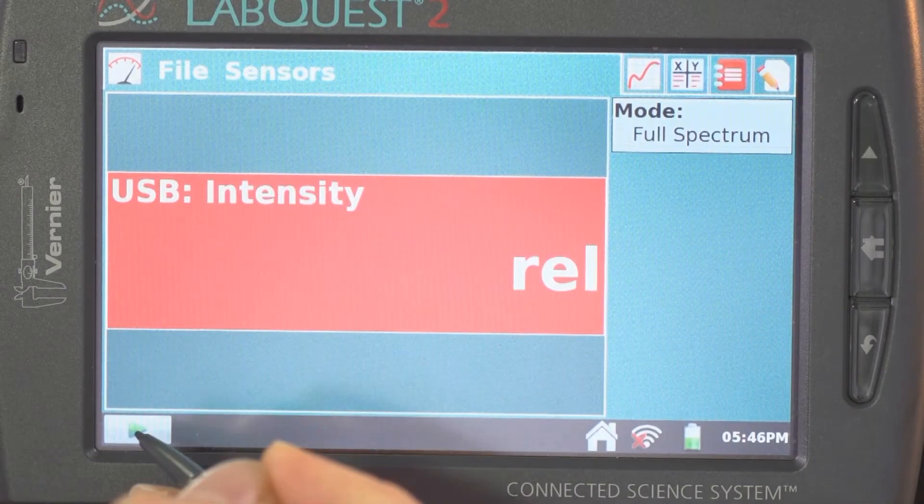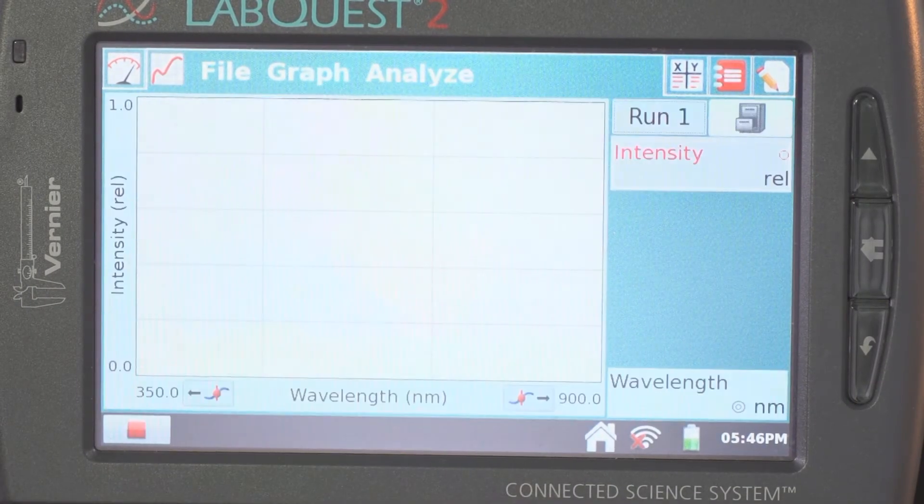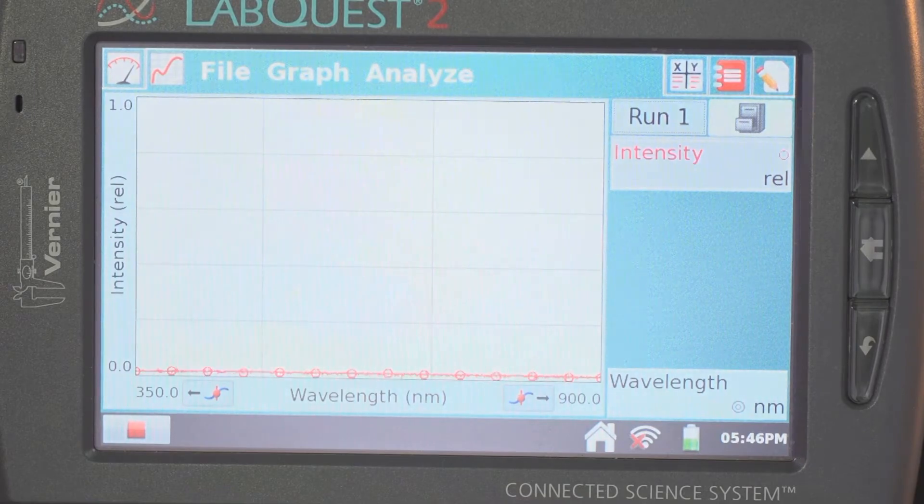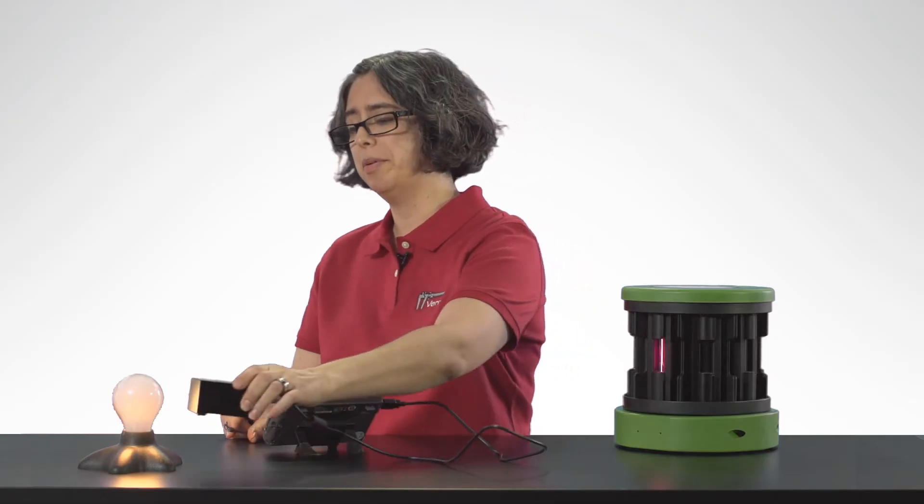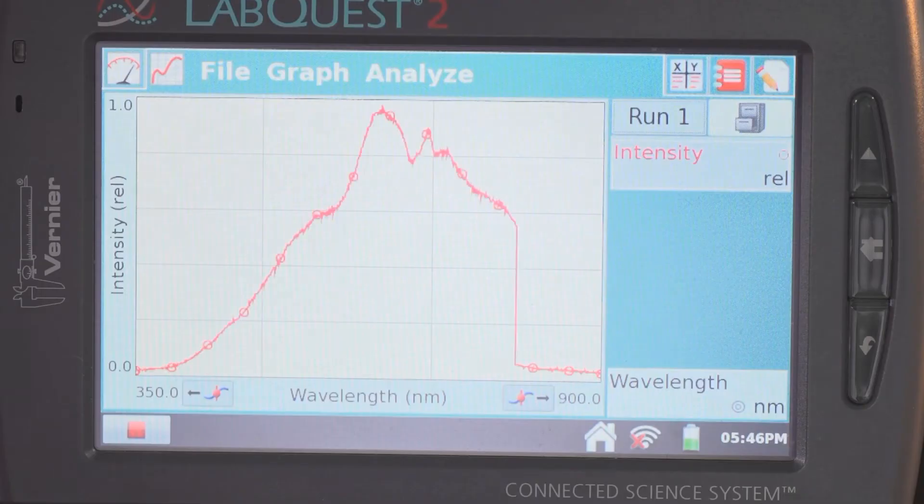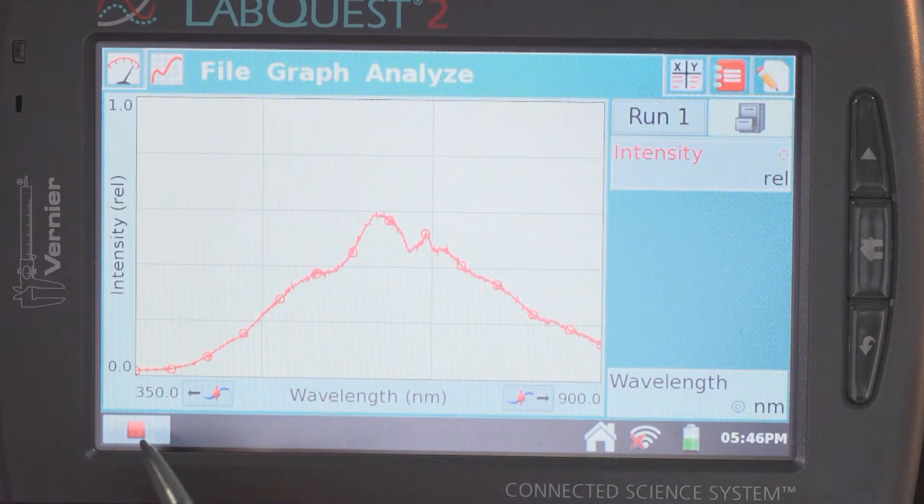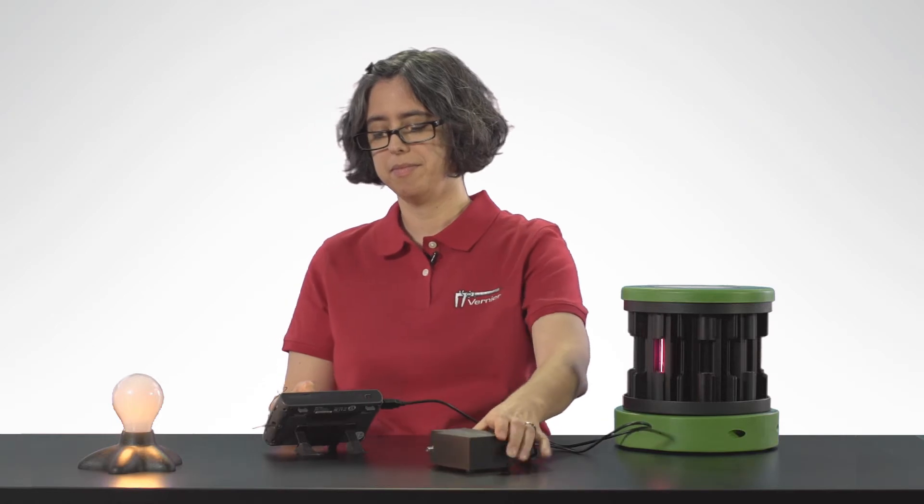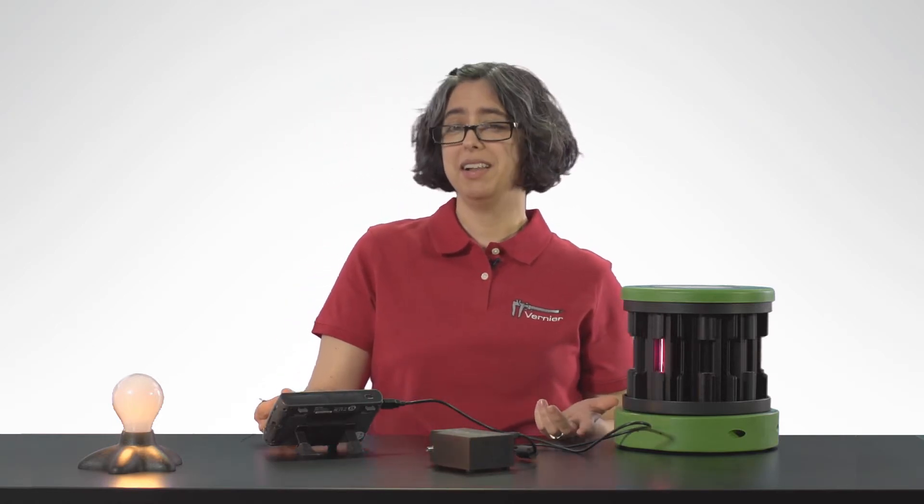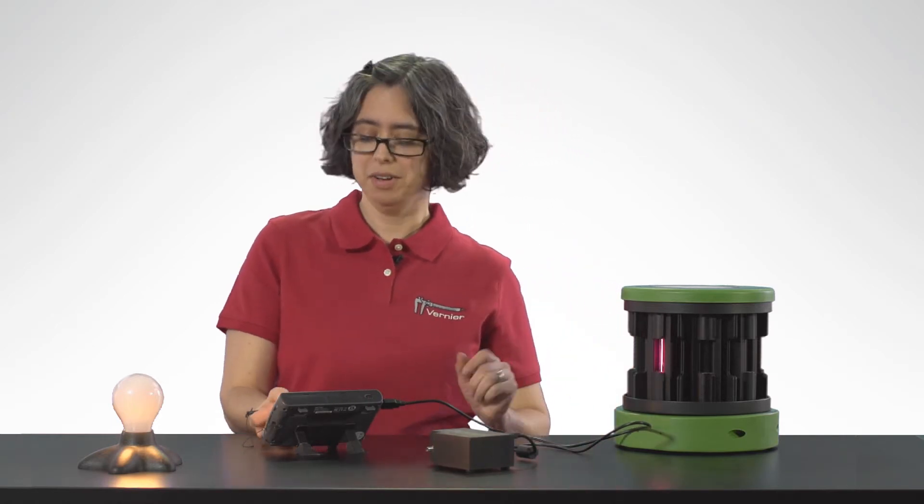When I tap collect, the spectrometer immediately starts collecting data. I will aim the aperture at this light bulb. When I'm satisfied with the graph, I will stop collecting data and I can analyze the graph. However, I'm not going to analyze it at this time because I want to show you another demonstration.